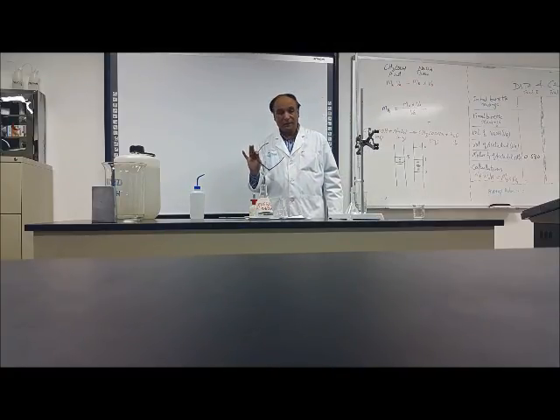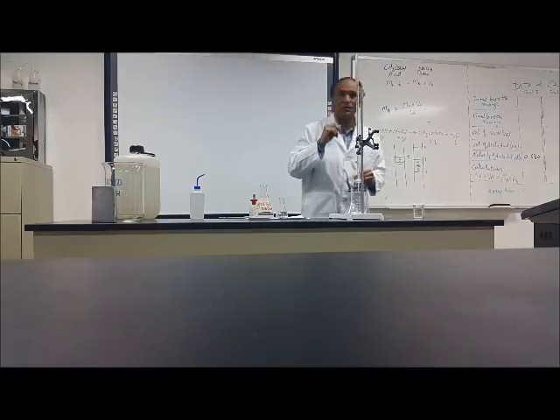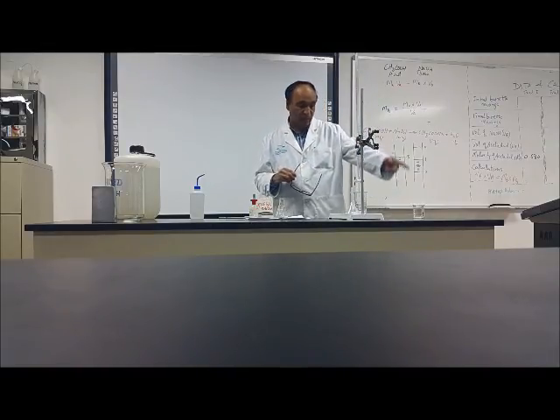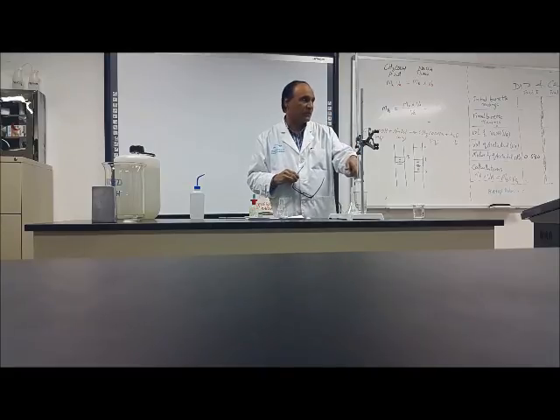Right? But still there are drops of water. We want to remove those drops. So I will wash the burette with this solution. Okay? Like I washed the pipette with this solution. So I will wash this one.